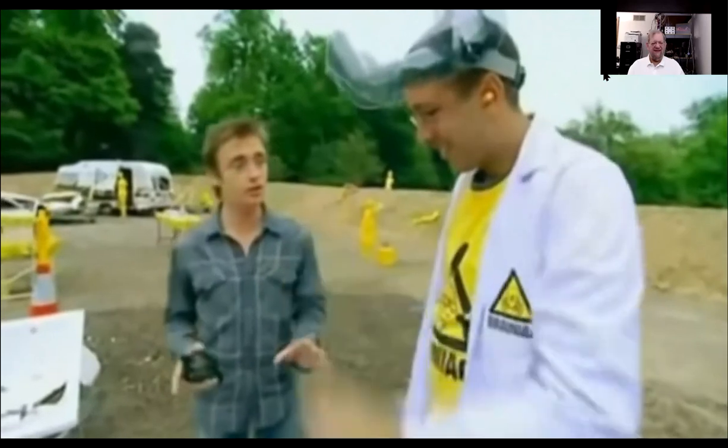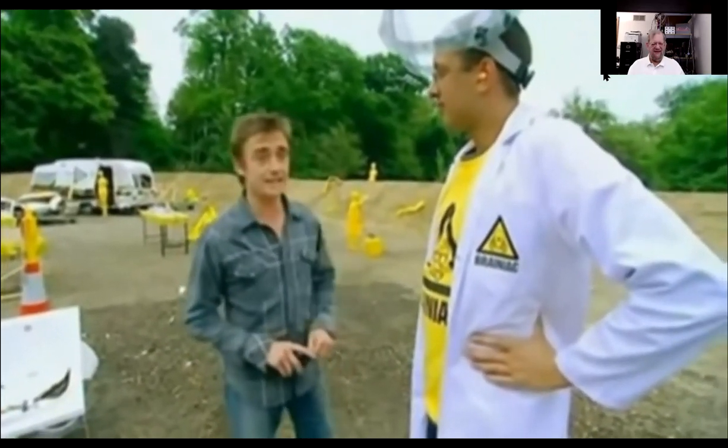Magnificent. And I think that concludes today's experiment. There is, I should say, one more, even more reactive metal, francium. But for some reason, they wouldn't let us have any of that. So, there you go. Today's lesson. Never mix alkali metals with water.